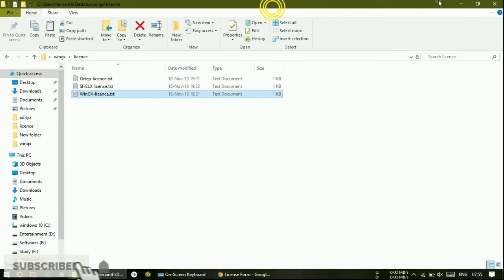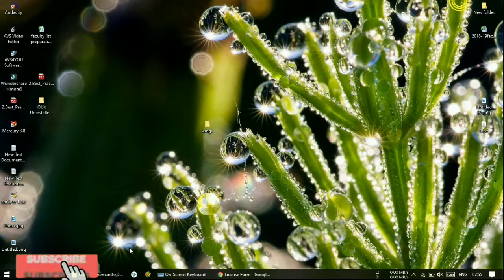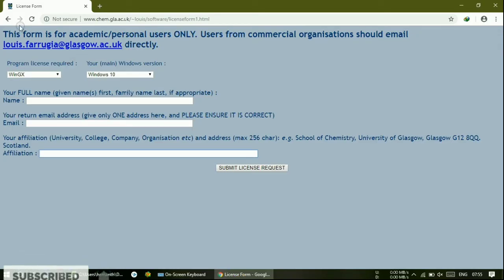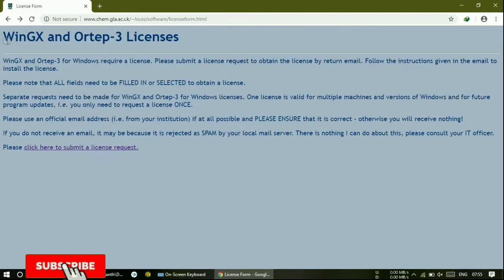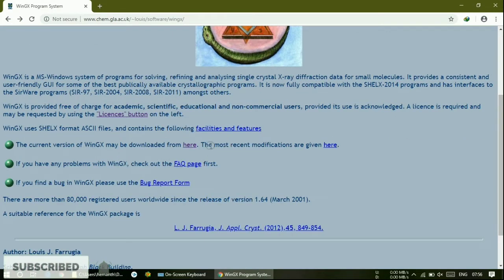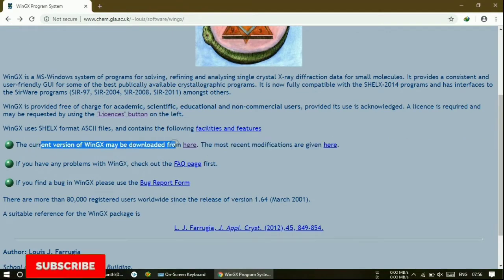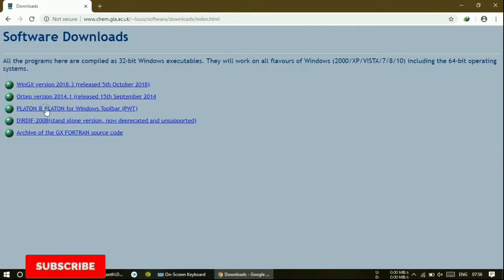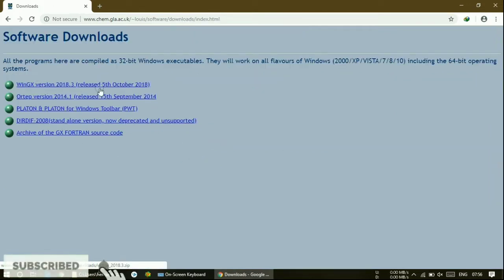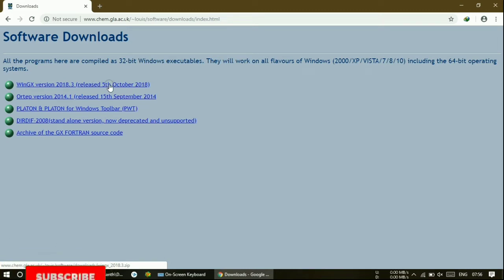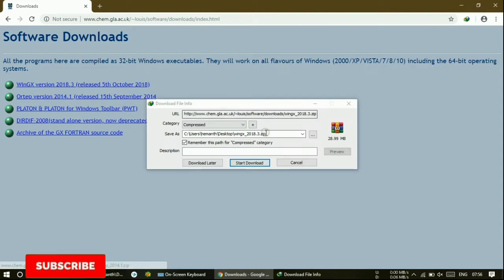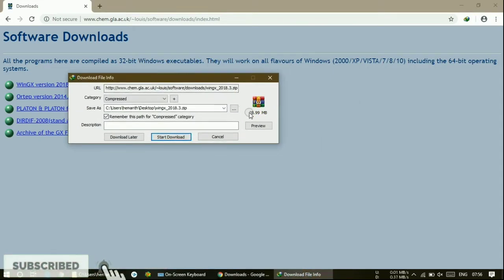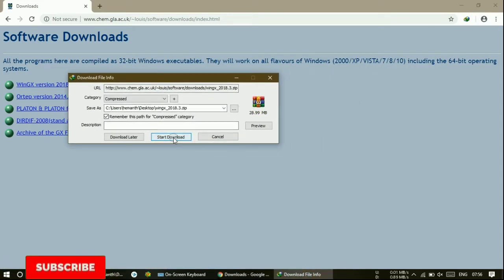After getting the license, just download the software. The current version of WinGX may be downloaded from here — just click onto this. You will get WinGX version released on 5th October 2018. It will get downloaded; it is around 28.99 MB. Just click 'Start Download'. As I have already downloaded it, I am just canceling this.